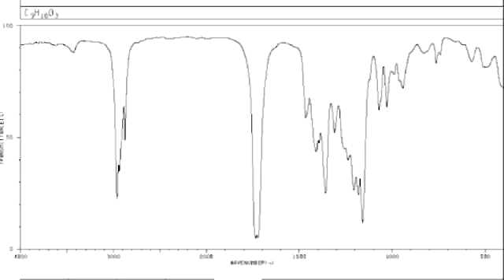Okay, next molecule. In this molecule, we can see we have several double bond equivalencies because it's C9H16O3. But we don't appear to have any C double bond C. So what are the double bond equivalencies? Well, we appear to have at least two carbonyls.